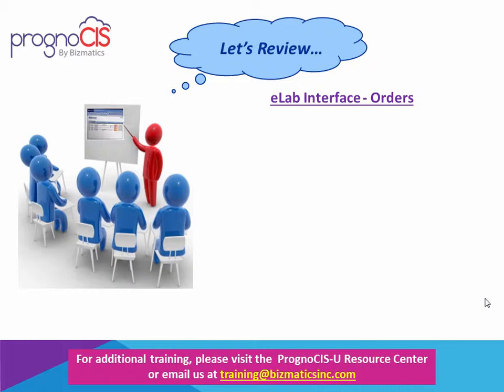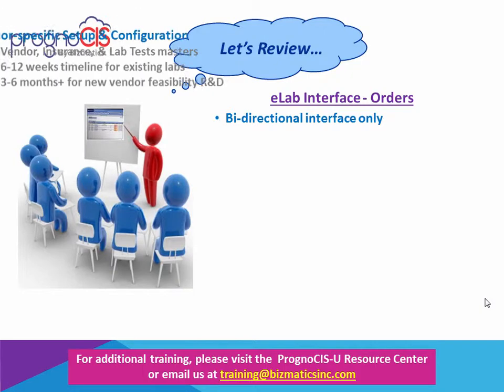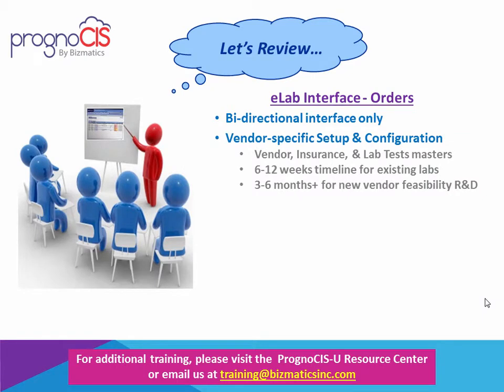So in review, eLab interface is available both as unidirectional and bidirectional, but as we discussed in this video, bidirectional is the one that includes the orders. Unidirectional, which is results only, is discussed in a separate video. With regards to the eLab interface, there are vendor-specific setup and configuration required, such as the vendor master, the insurance master, and your lab test masters.